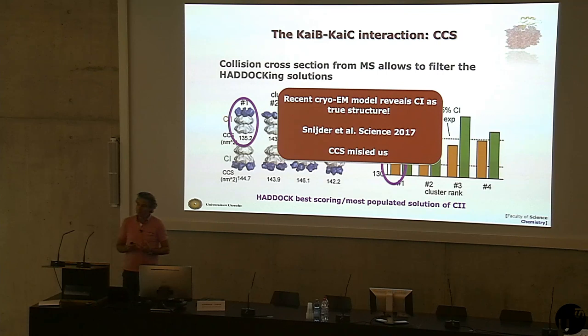That's a bit easy, but talking to experimental people, MS people, they also told me, well, you are dealing with a molecule which is not globular. So KC has this hole inside. So when you do those experiments, you know, it's a bit dangerous because there could be compaction of the structure. So what you are measuring is an underestimate of what you would have in solution. So that's one thing. So that could explain why the data do not match the model.